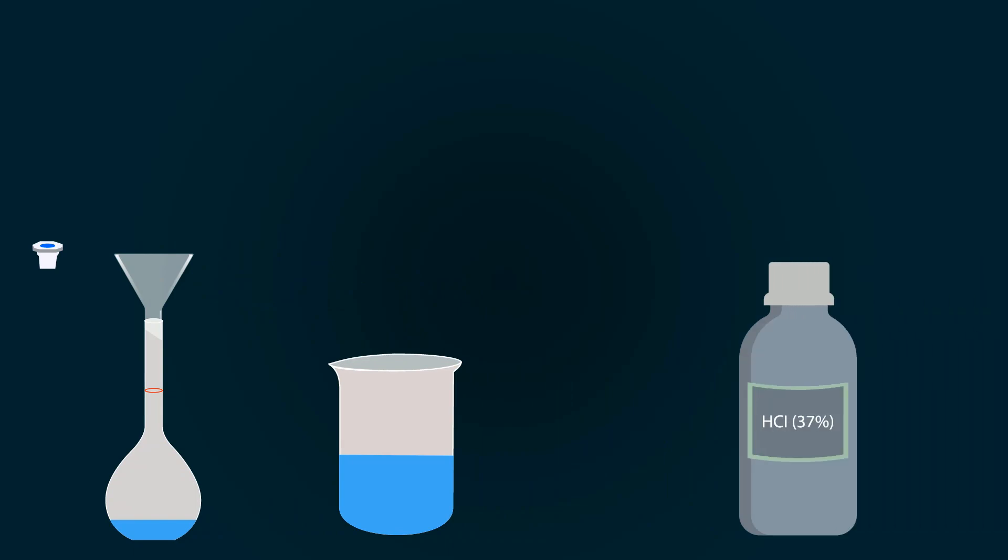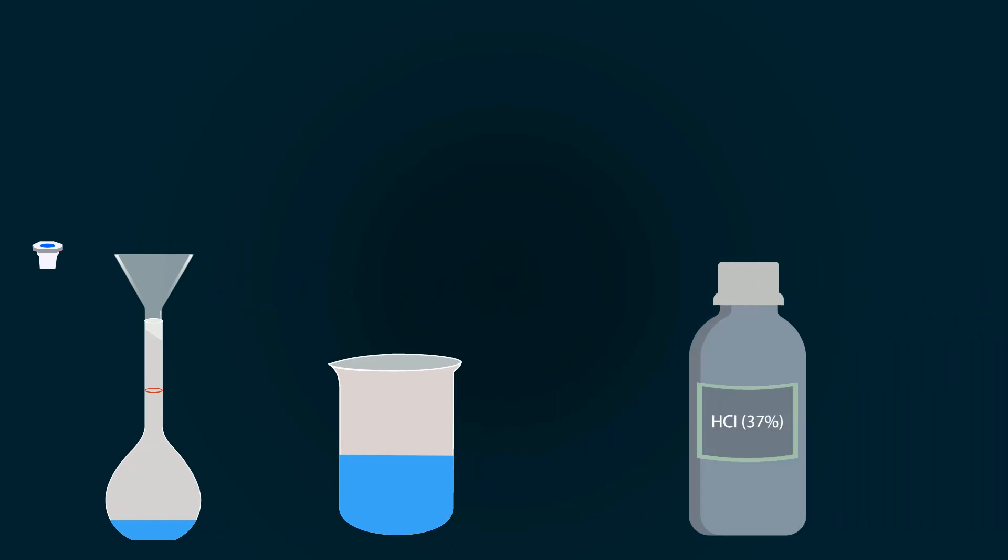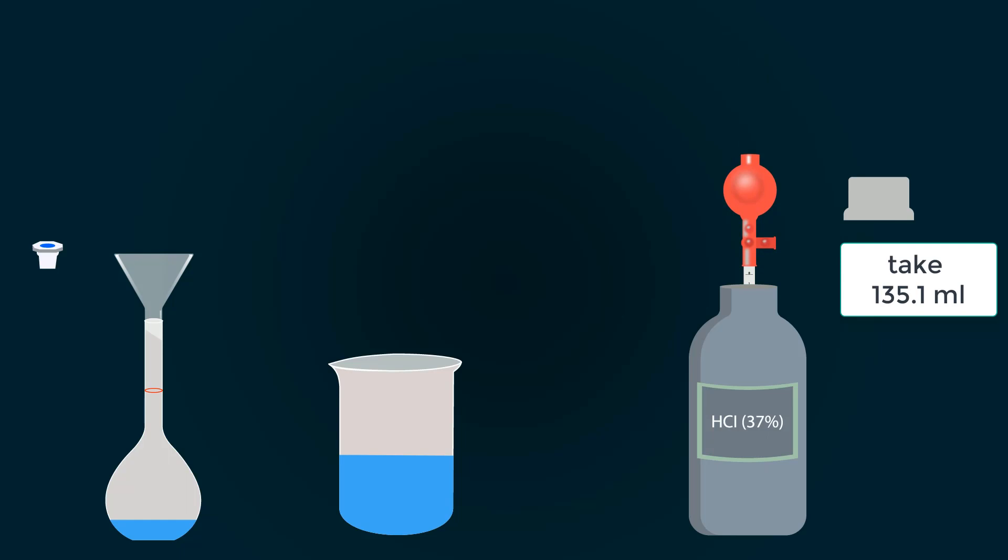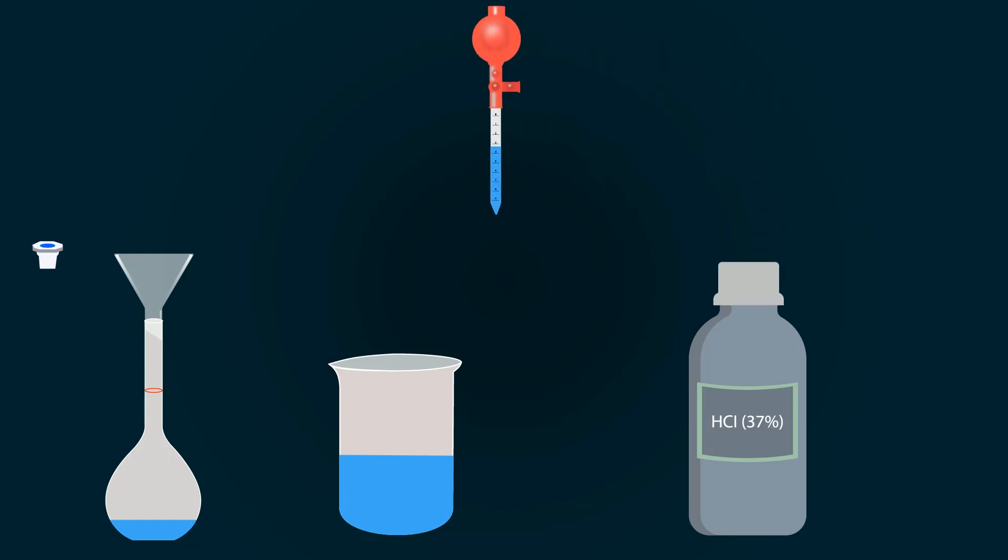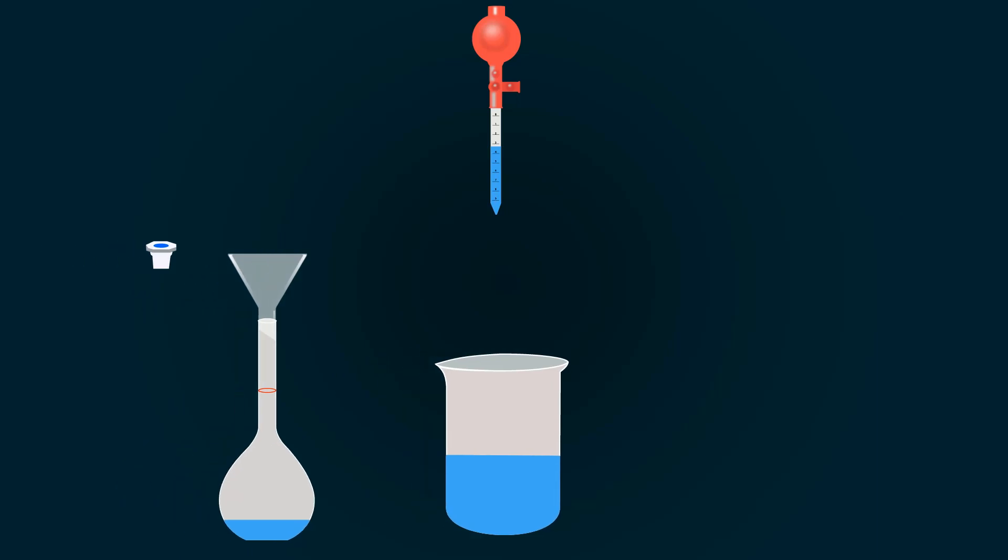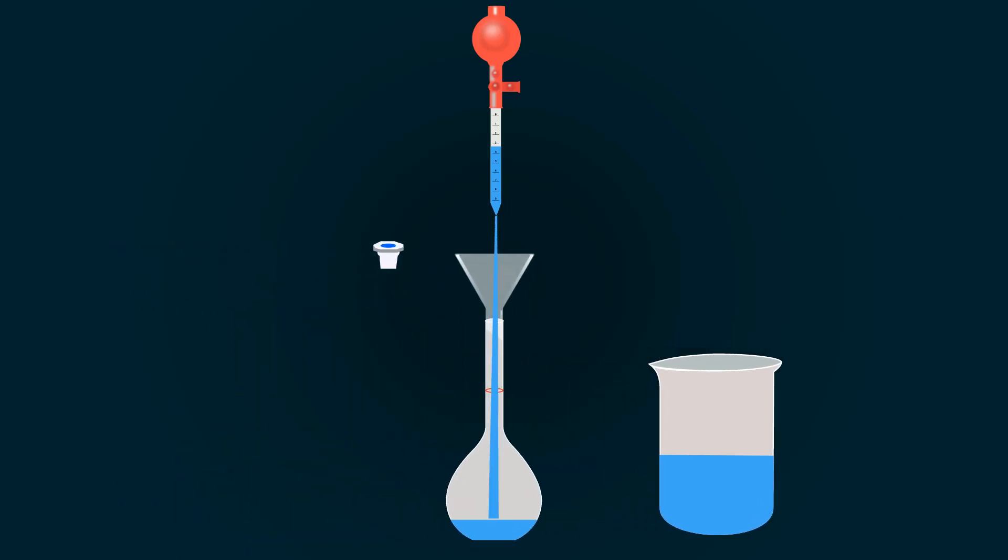Now take the bottle of 37% HCL. Open the lid and pipette out the required volume, which is 135.1 milliliters. Now pour this into the volumetric flask.